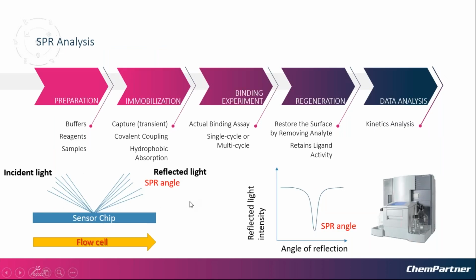In the left panel, we can see the analyte going through the flow cell. By monitoring the change in the intensity of the reflected light caused by the change in the refractive index, the peptides are screened against the analyte protein, and those that associate with the analyte are identified, which correspond to the regions of the target protein where binding occurs.